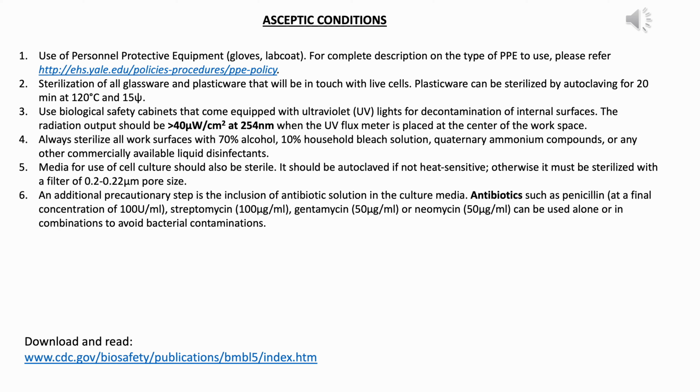all the times. And if there are any sharp objects, needles, scalpel blades, glass pipettes, then one has to use separate sharps containers, so that no kind of injury happens to oneself, and by that way infection can happen to you and contamination can happen to the cultures. Okay, so both can be avoided.